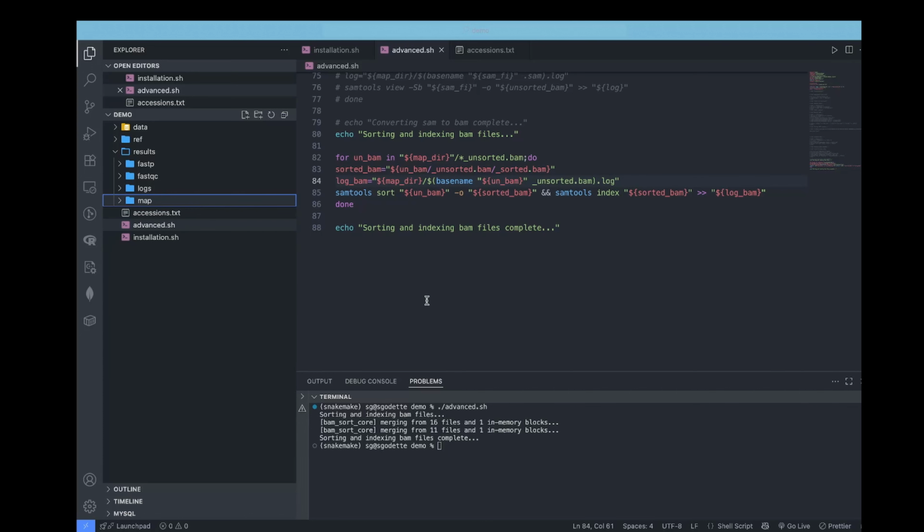The next step here is to call the variants, but before calling the variants, we need to run an mpileup of the bases. Now, let us first of all write the code or script for mpileup and the variant call, and then explain what the mpileup does. So I will start by commenting out this section.